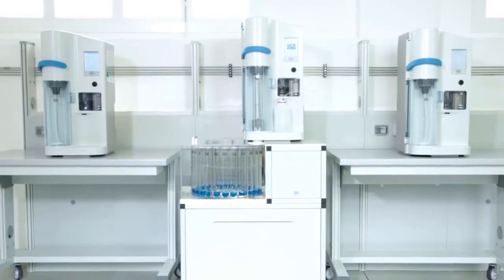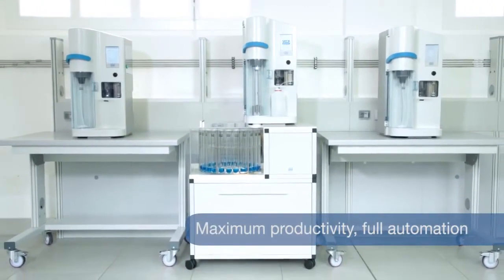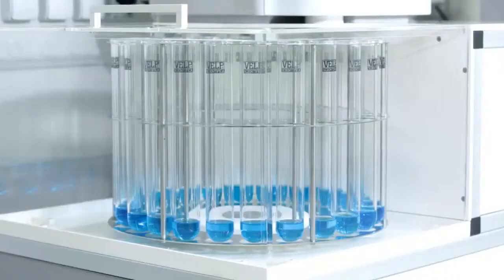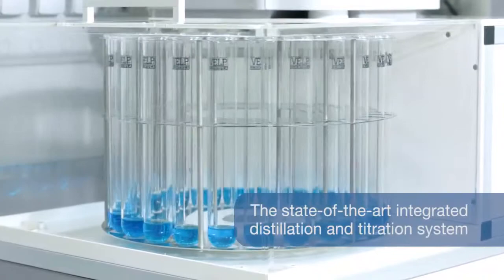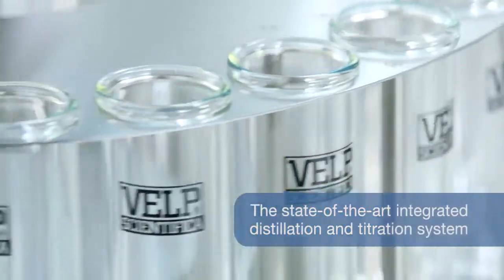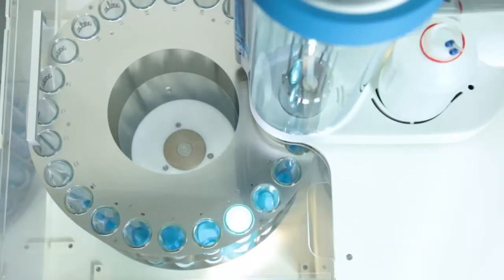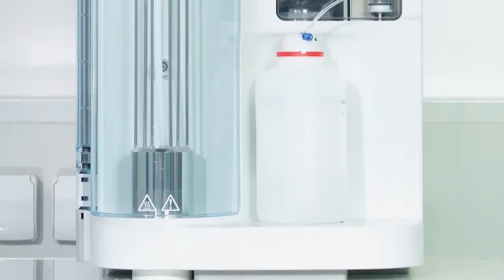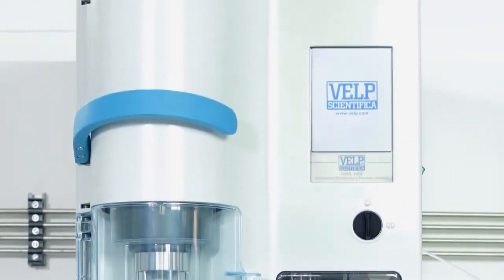The VELP UDK169 with AutoKjel AutoSampler ensures continuous operation and provides a simple and high-performance solution for safe and automatic distillation and titration. It achieves the most reliable results with colorimetric titration based on precise chemical reactions in Kjeldahl analysis.